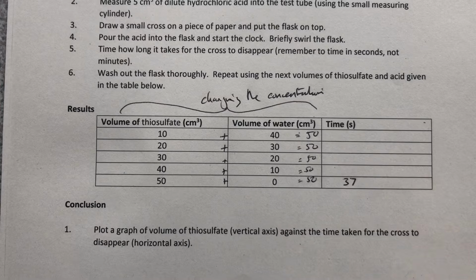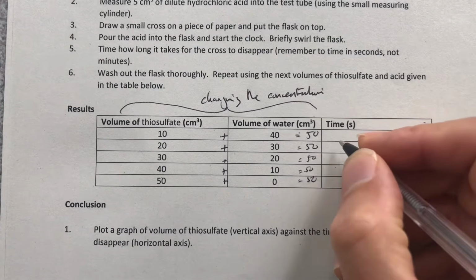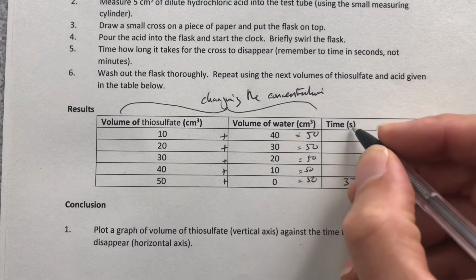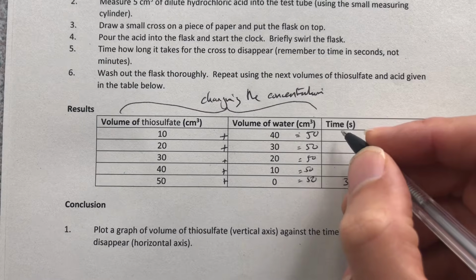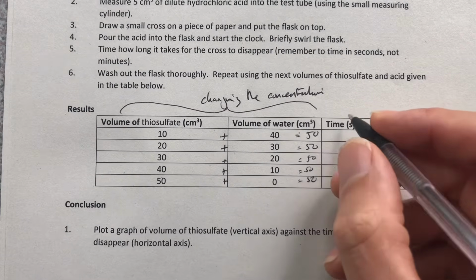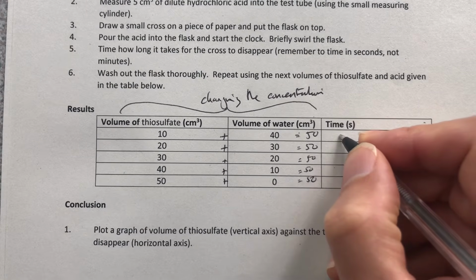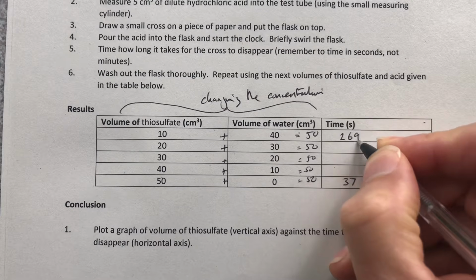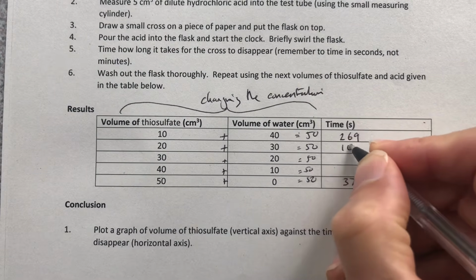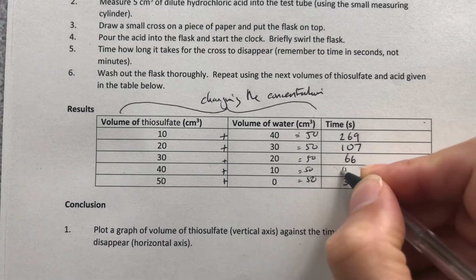Anyway, now rather than video the other 4 experiments, I've done those already. Okay, so the first experiment took 4 minutes and 29 seconds. Now we've got to be careful as we record this. We're going to record in seconds, so 4 minutes is 240 seconds. So 4 minutes and 29 seconds is going to be 269 seconds. The second experiment was 1 minute 47, so that's going to be 107 seconds. Then that was 66 seconds, and that's 46 seconds.